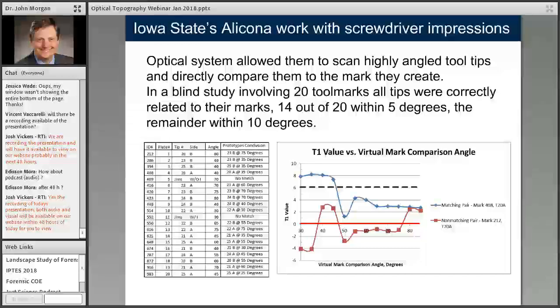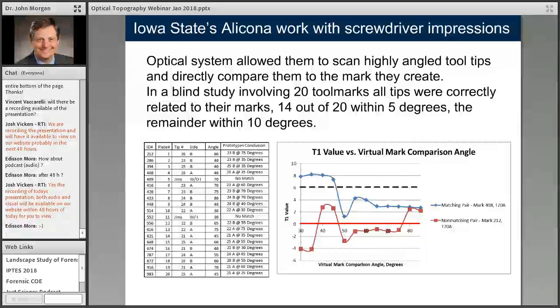One of the things, for example, that he's looked at is a series of screwdrivers, and you can see he actually looked at, it only shows 6, but I believe that there were 10. So here, tip 20, and side B of the screwdriver. This one did not match. This one matched a 23B, and said the screwdriver was at 75 degrees, and it actually was.